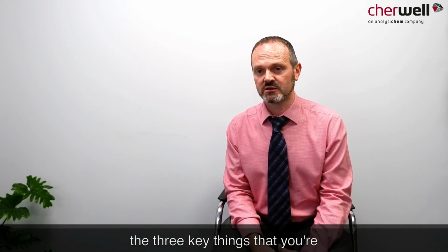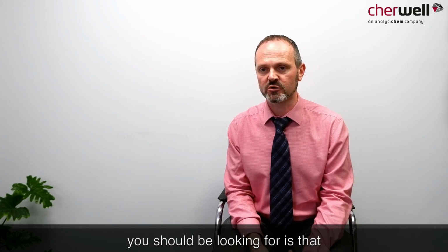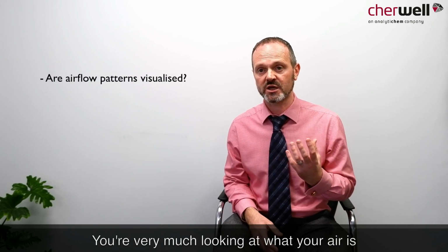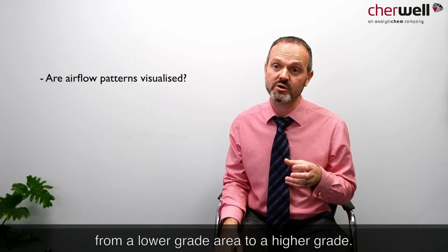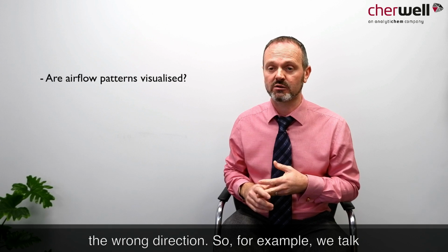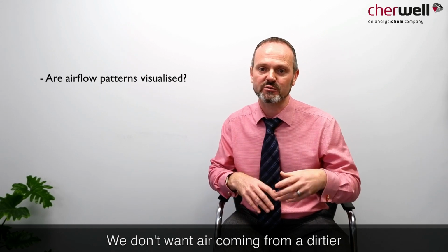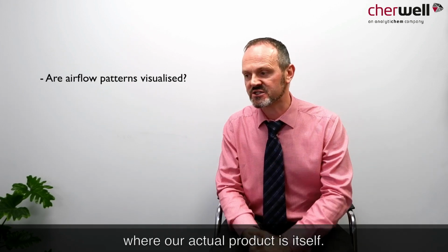To me, the three key things that you're really looking for as part of that, and what the guidelines really say you should be looking for, is that your airflow patterns are visualized. You're very much looking at what your air is doing, and whether you've got any ingress from a lower grade area to a higher grade, or whether you've got a reversal in the wrong direction. So for example, we talk about EU GMP classifications. Our grade A, which tends to be our aseptic core, we don't want air coming from a dirtier environment, from a grade B, a grade C environment, moving into that core where our actual product is itself.